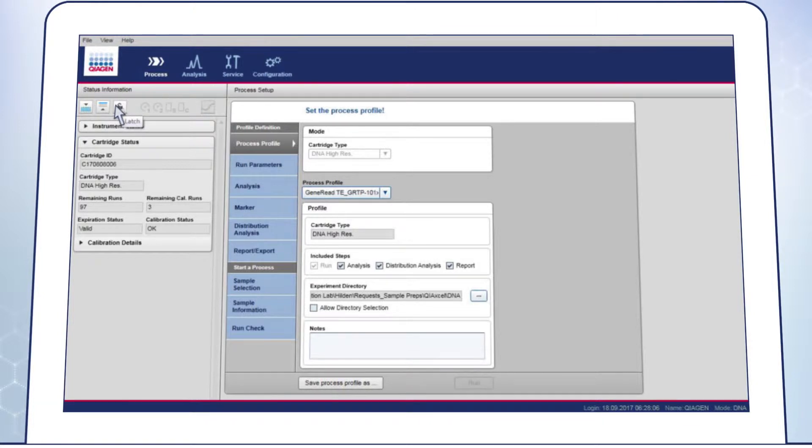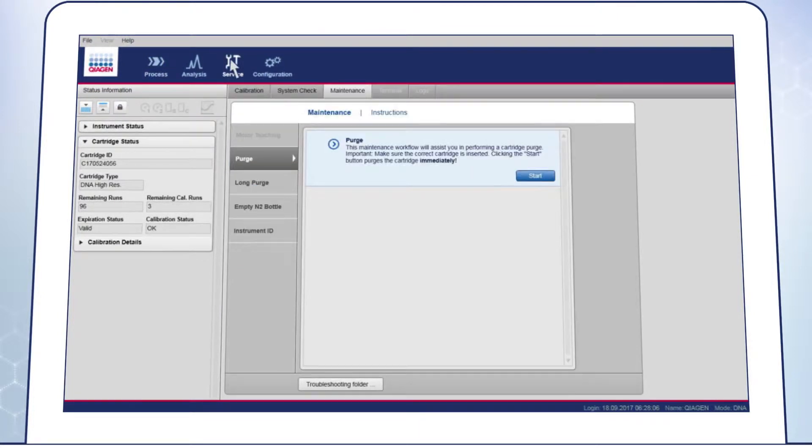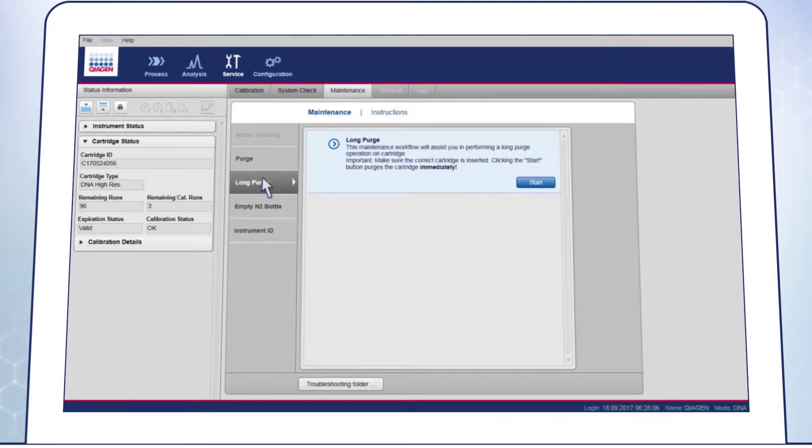Click Latch if automatic latching is not active. Go to the Service Environment and open the Maintenance tab. Then click on Long Purge to start purging.